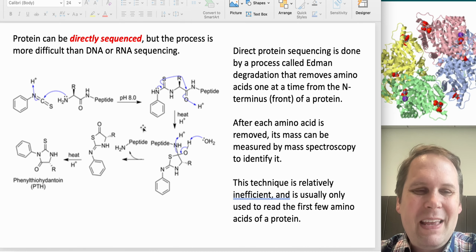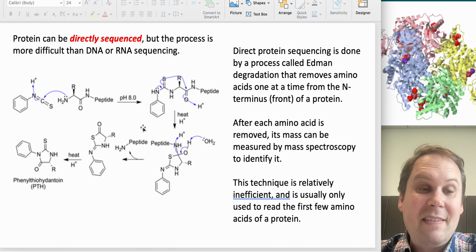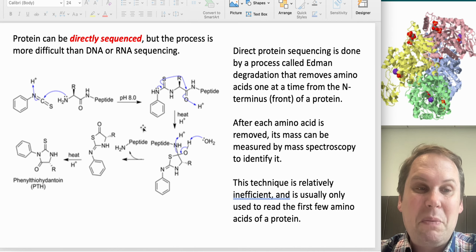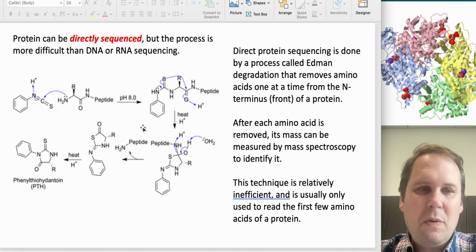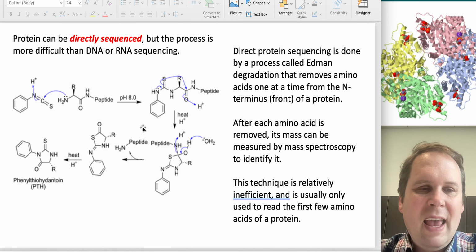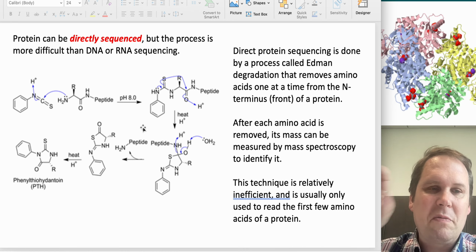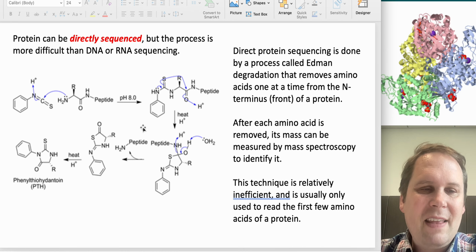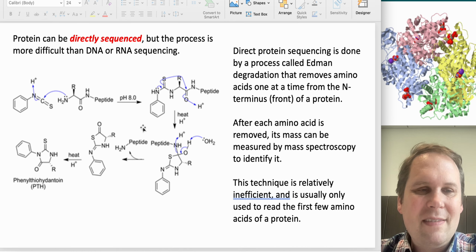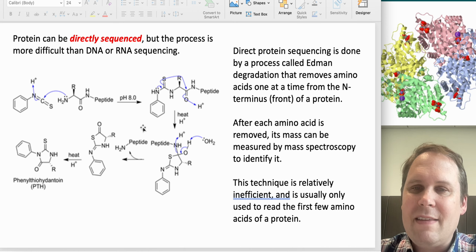The tennis ball, you can probably get to the wall, but it probably won't be as fast because it's kind of light. And then, if you had a nice heavy ball or a rock shaped like a ball, you could probably really fire that thing in there and it would hit hard. And so this is how it works. You accelerate the proteins, or the peptides, the little amino acids, and depending on how much mass they have, they fly at a certain rate, and you measure how long it takes for them to hit the detector, basically. And from that, you can calculate the mass of the thing that you threw. Yeah, it's sort of indirect, but it's very useful, and it's good.